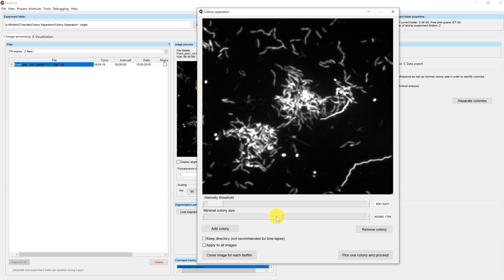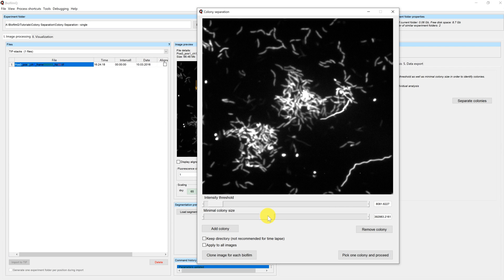If we move the slider further right, also the big colonies will disappear. Let's set the slider to a reasonable value where the two big colonies remain.